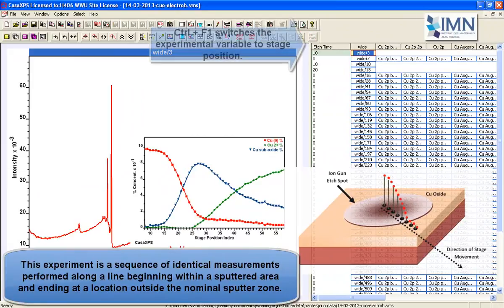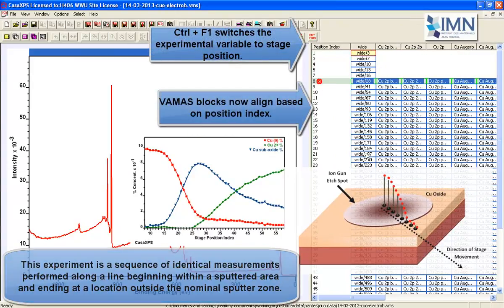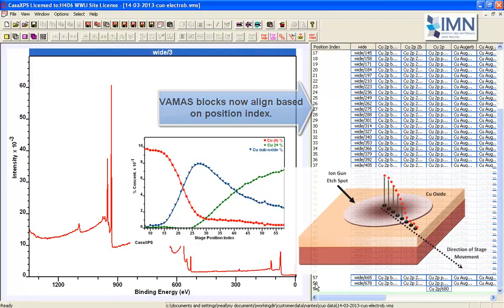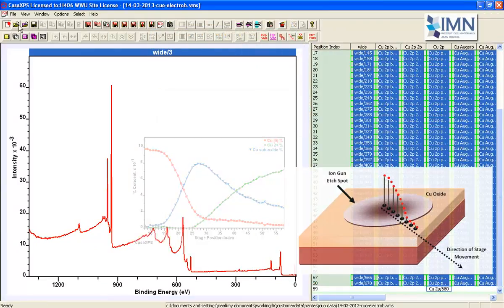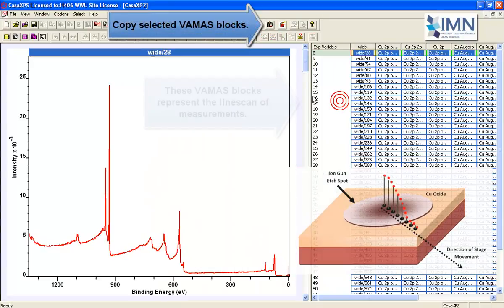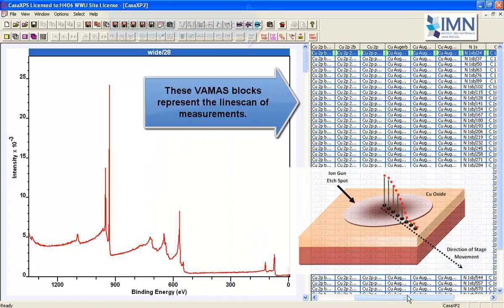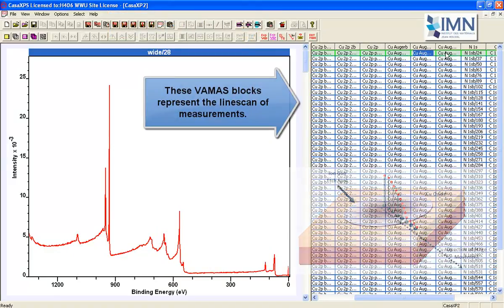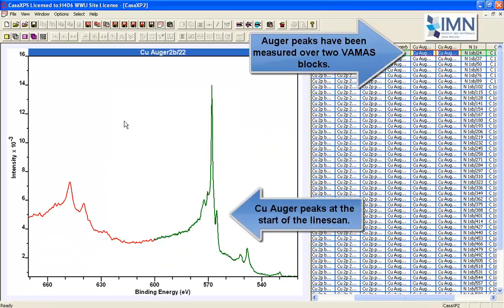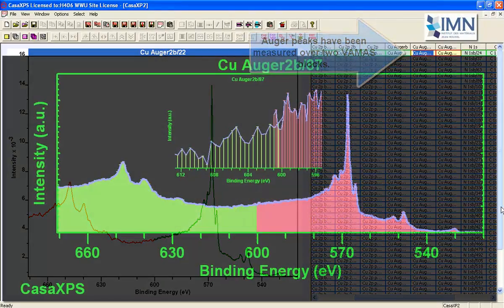To investigate this, we're going to perform a sequence of measurements where we have taken a copper(II) oxide which has been sputtered using an argon ion gun. At the center of this sputter zone we have metallic copper, and as we move along a line scan we end up with copper(II). Somewhere in between, we have copper in a suboxide state.